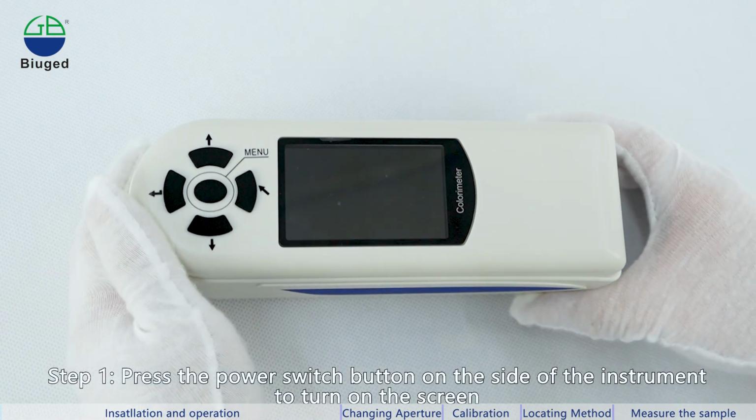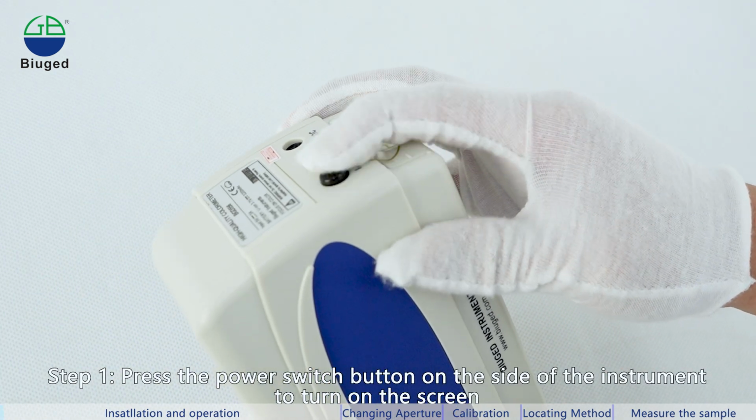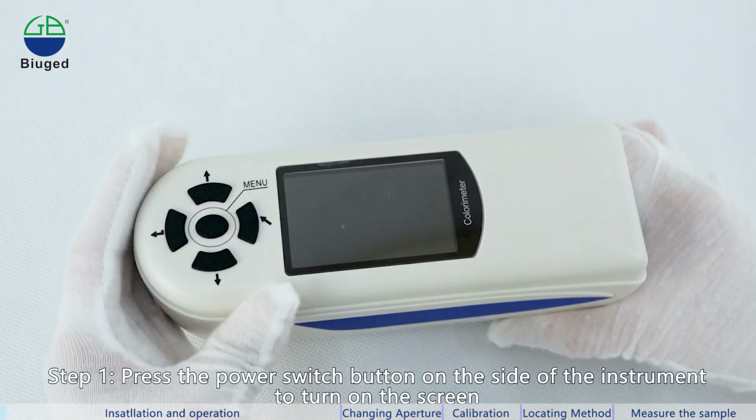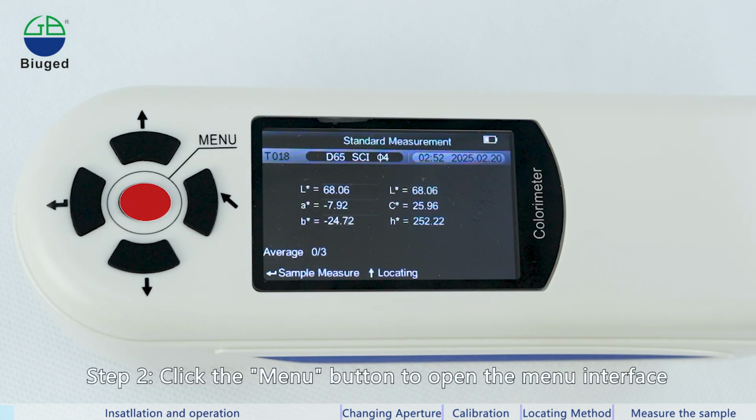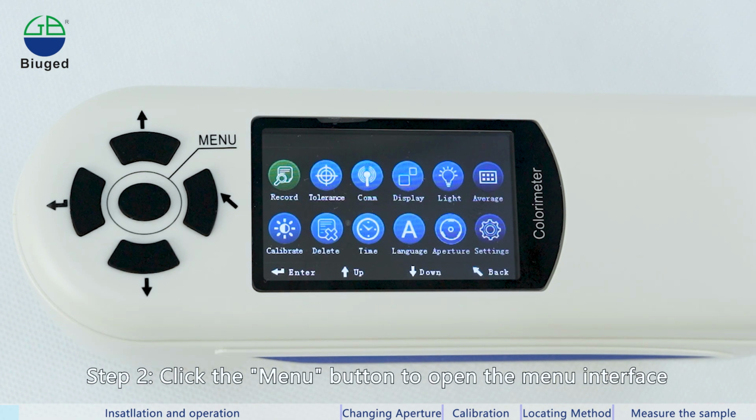Step 1. Press the power switch button on the side of the instrument to turn on the screen. The instrument will automatically enter the standard measurement interface. Step 2. Click the menu button or the back button to open the menu interface.